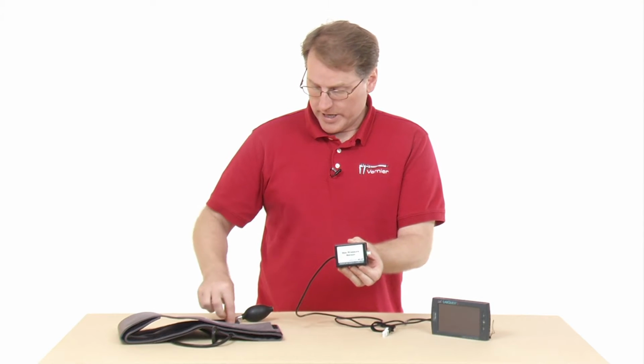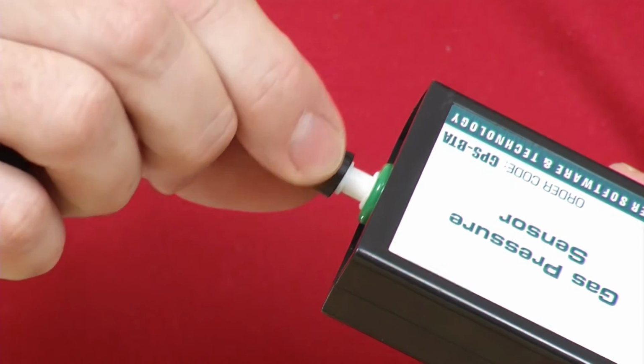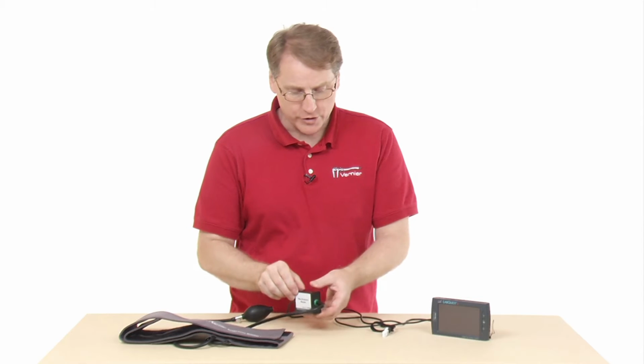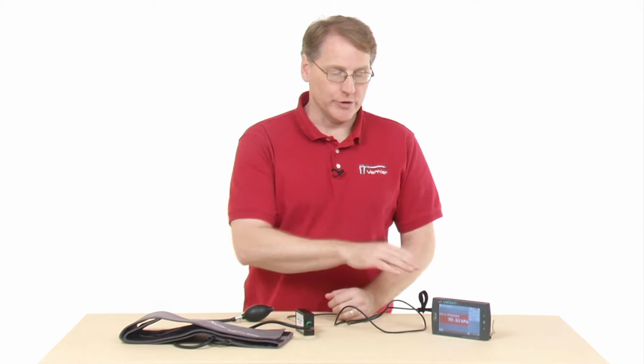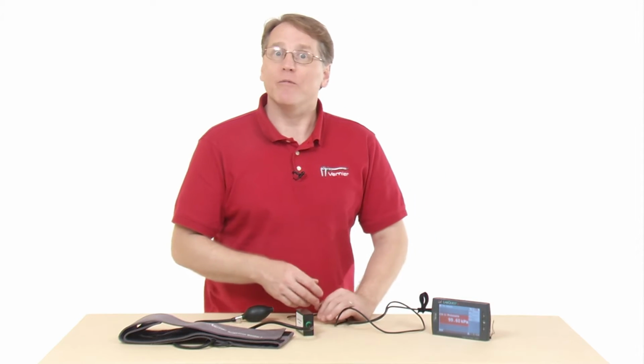And the way it works is that you attach the respiration belt to the pressure sensor like that, and then you plug in the gas pressure sensor to your collection device. Now, one thing that's going to happen is that in this case the LabQuest 2, it recognizes that I am using a gas pressure sensor. But what I really want to be using is this respiration monitor belt. And I have to go in and set this up to let it know that I'm actually using this as an attachment to the gas pressure sensor, and so I'll need to do that before I can actually collect any data.